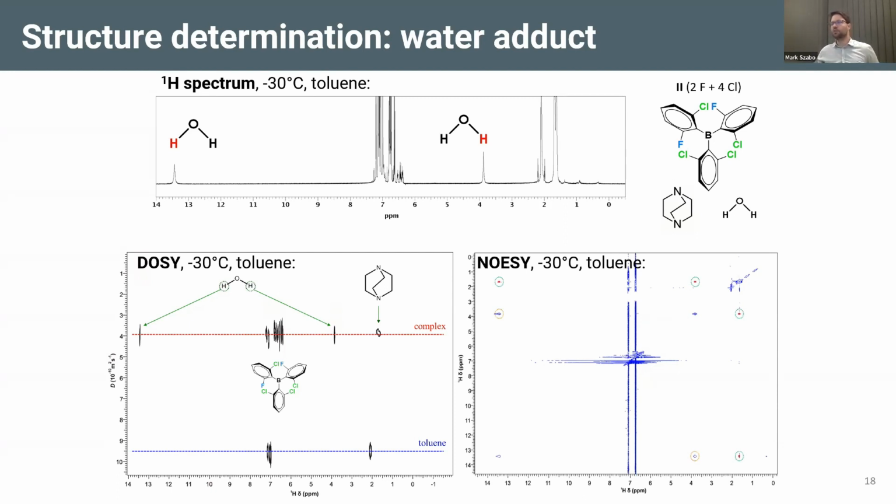So to really investigate mixtures which have several components, you can do this by DOSY, but you need well-defined separated signals of each component in the mixture.